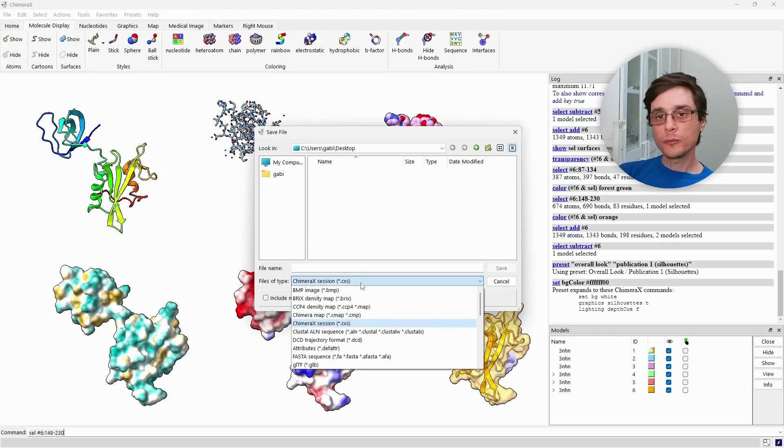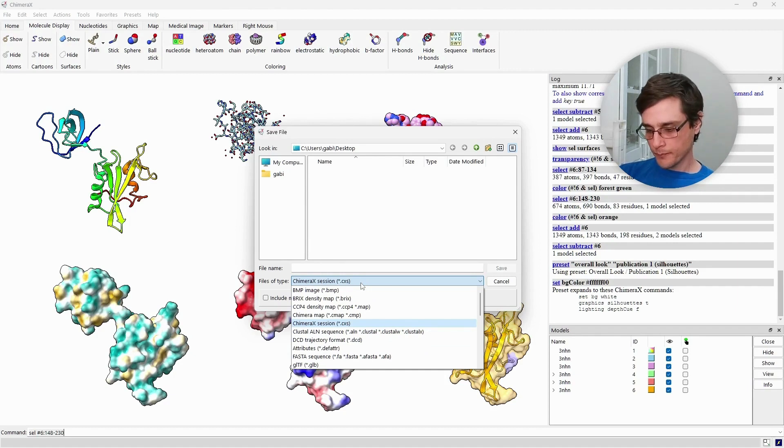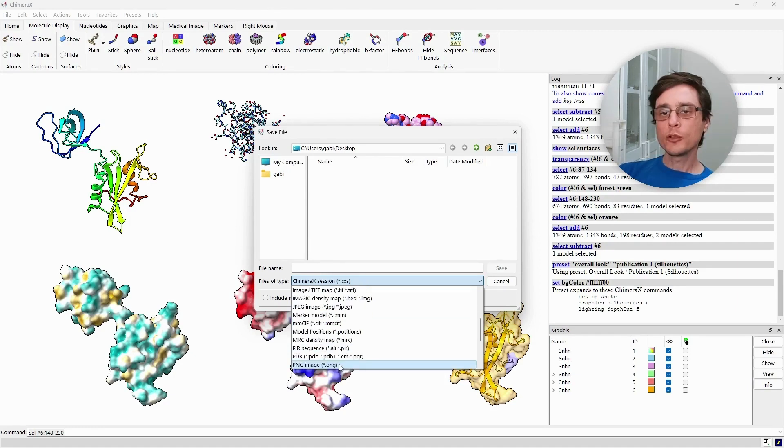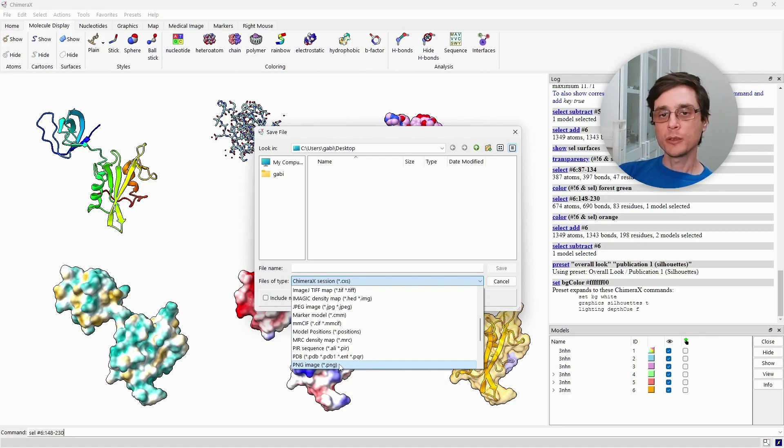Alternatively, you may want to produce a more standard format such as PDB, or you may want to export an image of your structure. You can even export videos, but we will cover this another time.